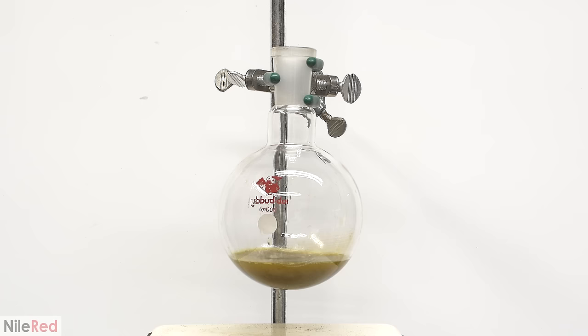So after about an hour, I take it off the stand and there's quite a bit of solid stuff. This is very easily removed by just passing it through a little bit of cotton. The cotton and the flask are washed a few times with a little bit of isopropanol.